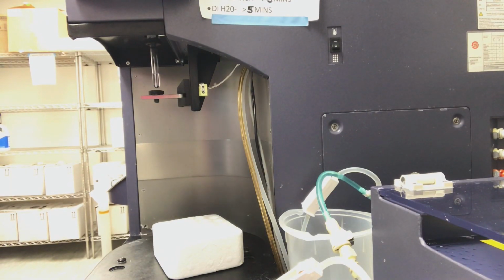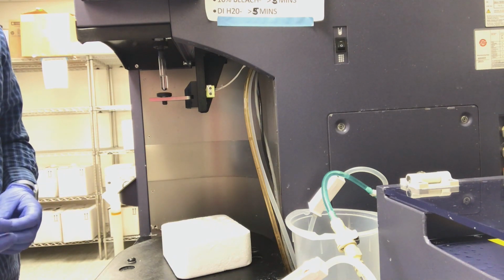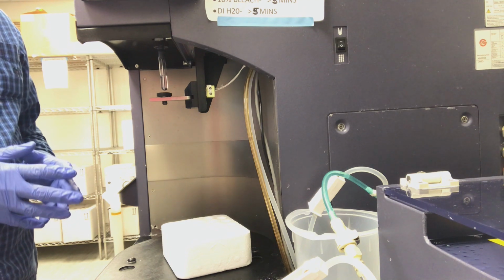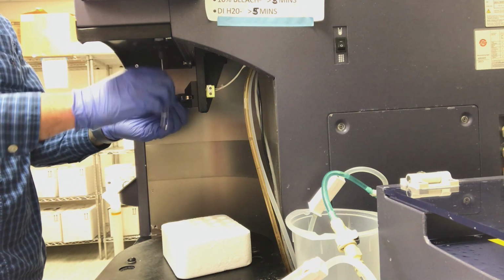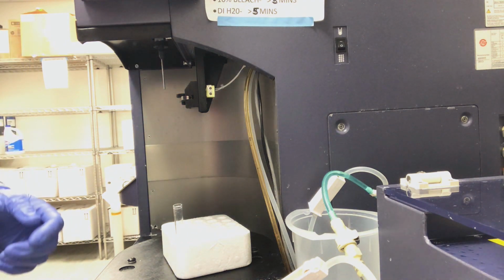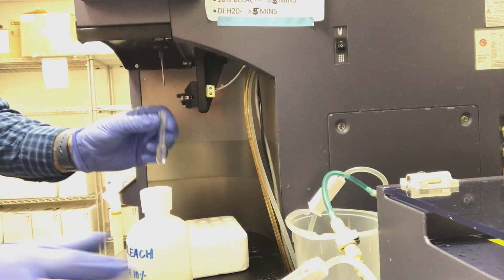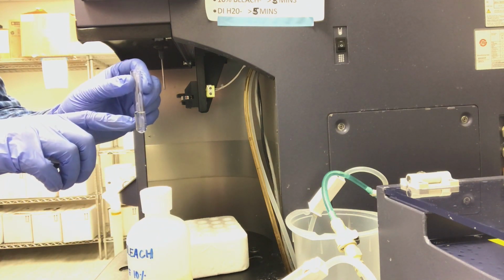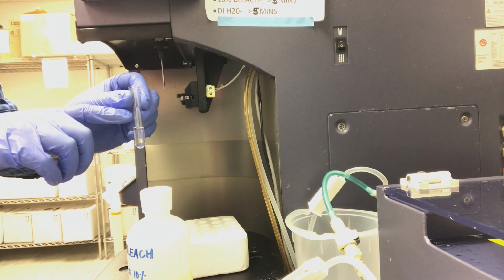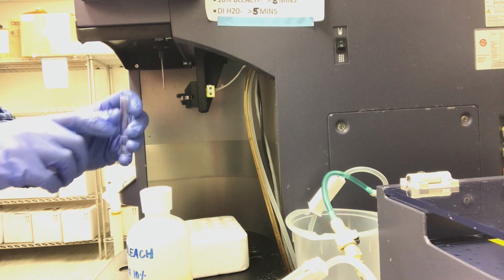At this point, fast forward to you being done with your samples. We want to clean the machine after we're done. So we'll remove the water tube. We'll make up a tube of bleach using our bleach bottle. Put a little bit of bleach in the bottom. Raise the level of water on top of that to about 2 to 3 mLs at max.